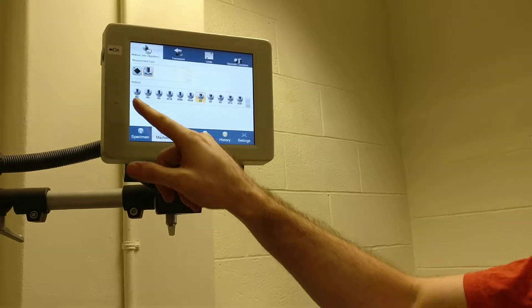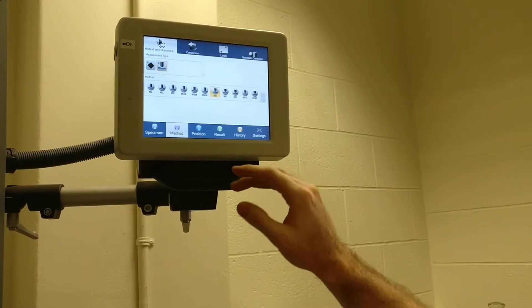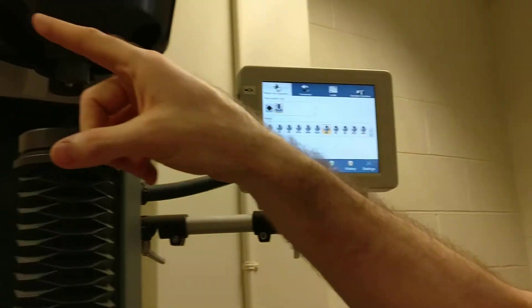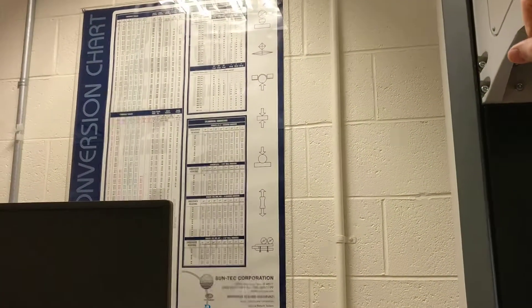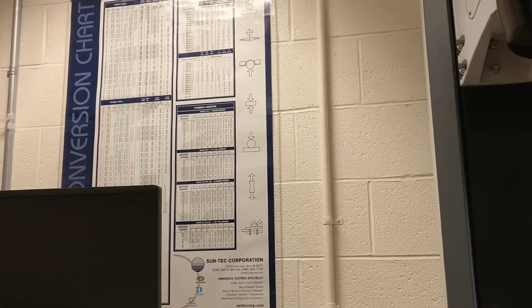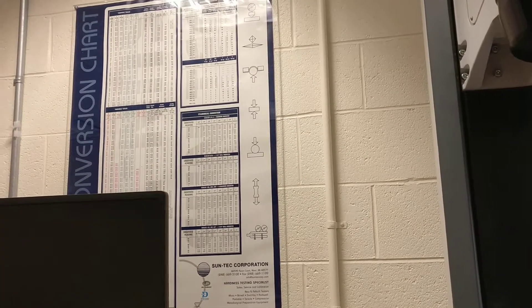You choose your method here — it's got all the Rockwell scales. If you need to know what these scales do, on our poster up here we've got all the columns that tell you the load and what type of indenter it uses, and you can also cross-reference between those scales.